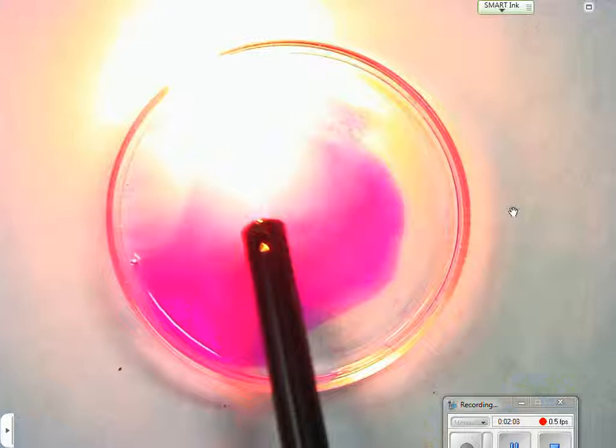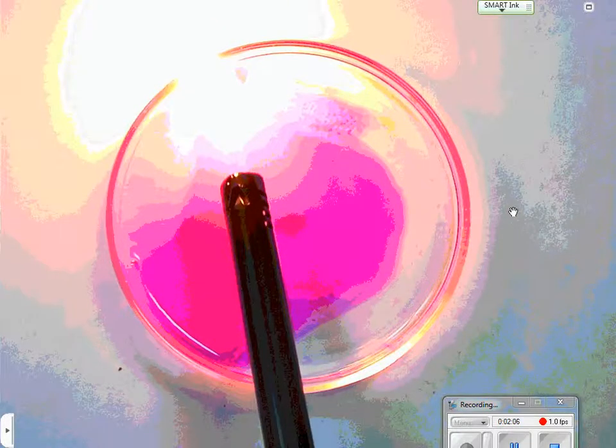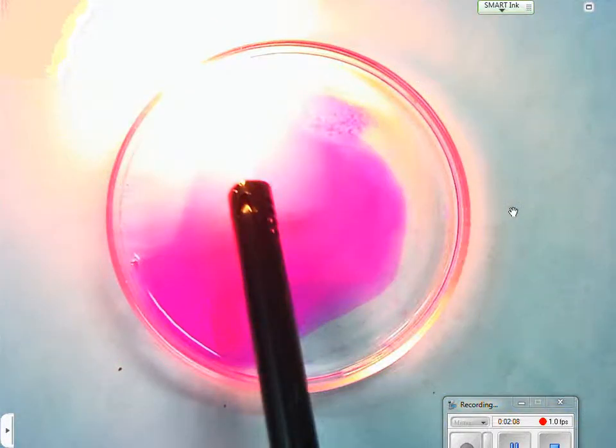Okay. It... Yeah. Okay. That's the hydrogen gas that's popping on us. Okay.